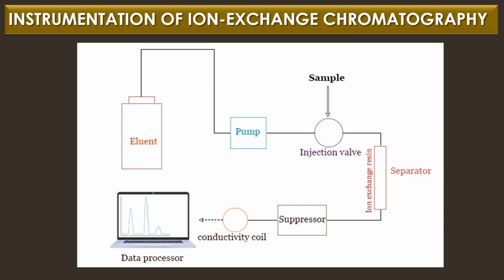Instrumentation of ion exchange chromatography. The important parts of the ion exchange chromatography are pump, injector, column, suppressor, detector, and data processor.